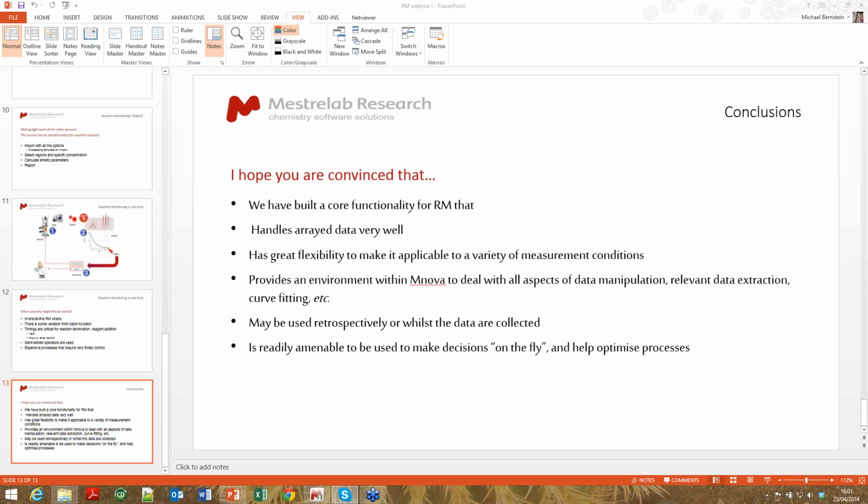Yordi asked, sometimes it used to crash when you load a lot of spectra. Any recommendations to avoid that? Well, I find that I can load 500, 600, 700 data sets. You know, what's a lot? How can you avoid that? You can do import decimation, I guess. If you're working up to 400, 500, 600, 700 data sets, I don't anticipate problems. If you are having problems there, then it may be that your hardware isn't up to the task.